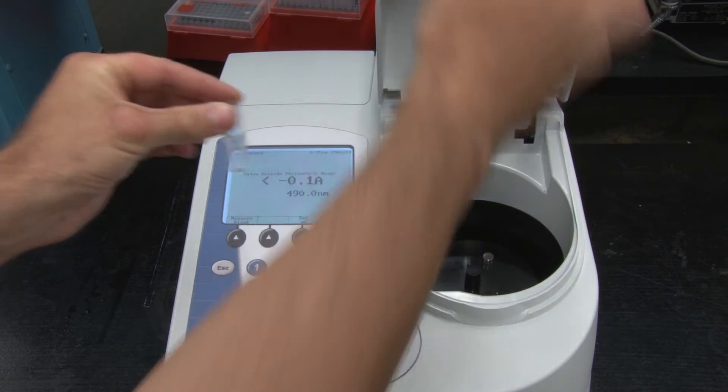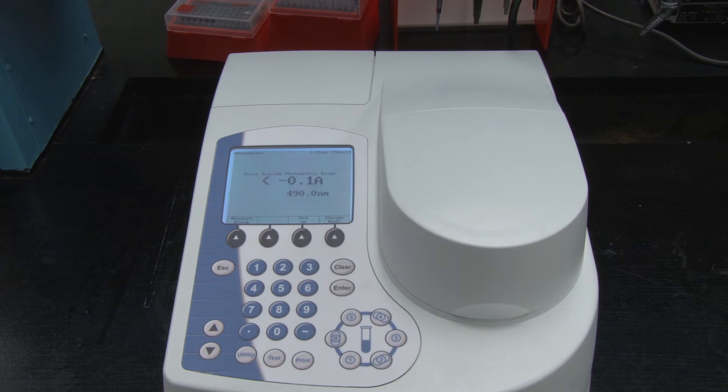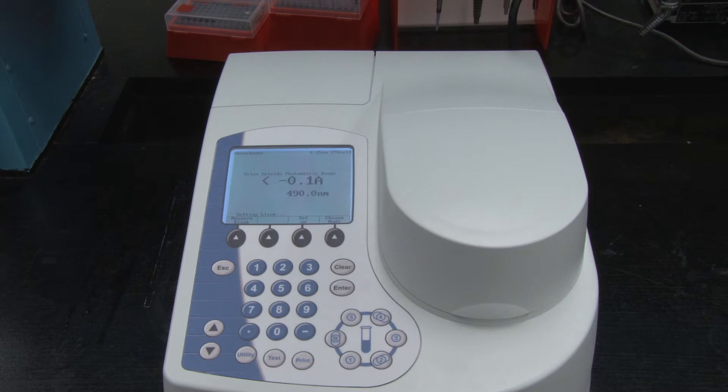Blank the spectrophotometer by inserting a cuvette containing the background of your sample, ensuring that the arrow of the cuvette faces from front to back. Press the blank button and the spectrophotometer will calibrate so that your blank will read zero.